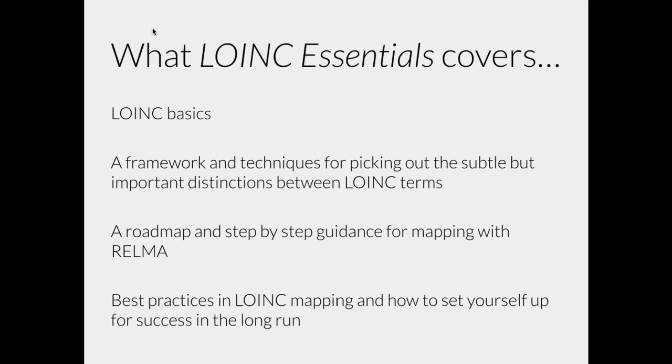It covers some of the things that you'll hear today, so basics of LOINC. But the reason I wrote it was there really wasn't any as good as the LOINC user's guide, and the Relma manual, and even the trainings. There wasn't an end-to-end document that walked you through things step by step.